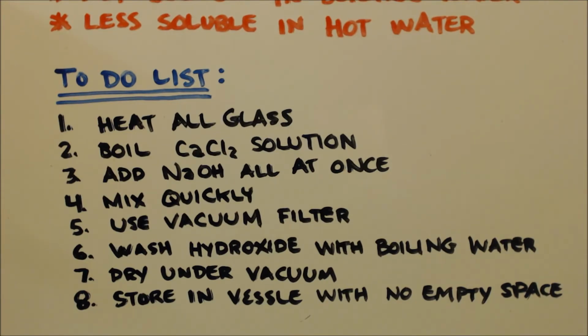Now, before I finished the video, I threw a little chunk of the hydroxide in some acid to see if it fizzed at all. And it really didn't fizz. So that was good, telling me that there's no carbonate in it. I brought the funnel downstairs. That must have been another 15 minutes. So a half hour between making it and doing this filter thing.